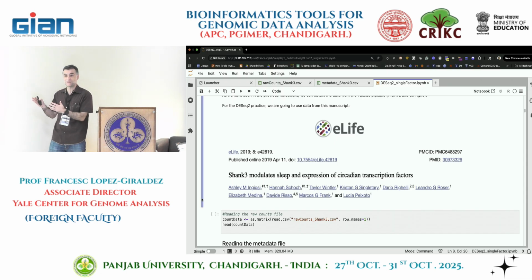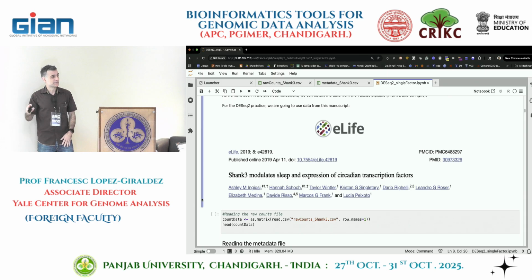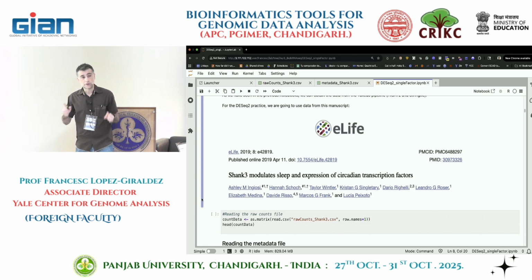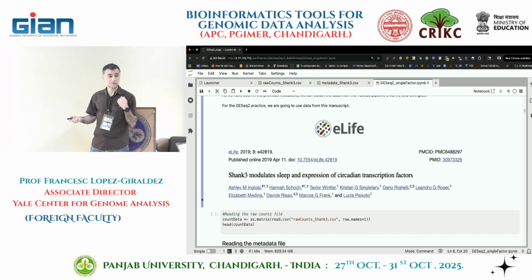We are not following the same analysis steps they did, but I'm wondering what they did. I don't know. One day I need to redo the analysis the way they did it. I've never done it. We never have the time, right? But I don't think they used DESeq2. If you have time, if you click here, you're going to go to the paper, so we can check exactly how they did it. Another thing I did, I created the raw counts myself. These are analyzed pretty much in the same way you did yesterday, which doesn't mean it's the way they did it.